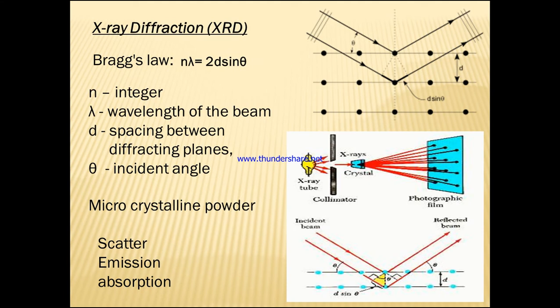The geometry of the incident X-ray impinging on the sample will satisfy Bragg's equation, giving constructive interference. The peak intensities depend on the angle of incidence as well as reflection, and on the intensity of these X-rays which are being produced.